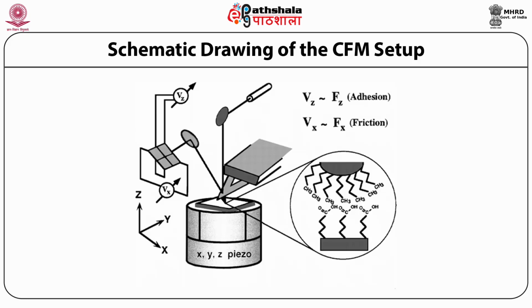With an instrument sensitivity of the order of 0.1 angstrom, minimal forces in the range of 10^-13 to 10^-8 N, depending upon the cantilever stiffness, can be measured. Hence, AFM can in principle measure molecular interactions ranging from weak van der Waals to even slightly stronger forces.